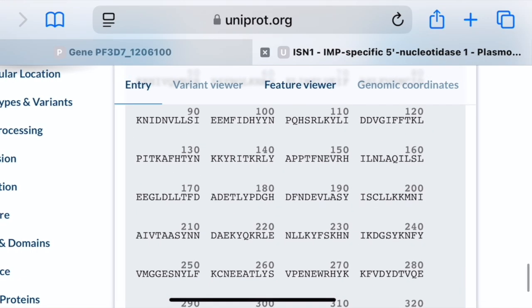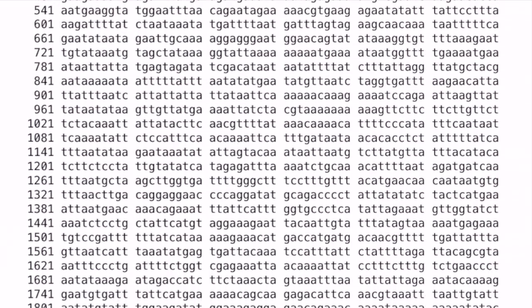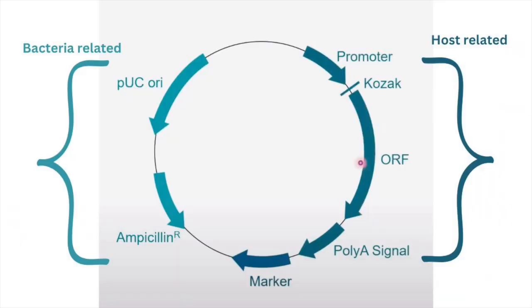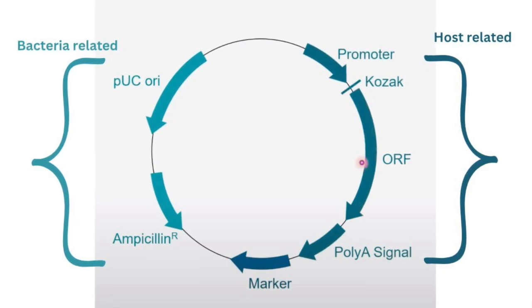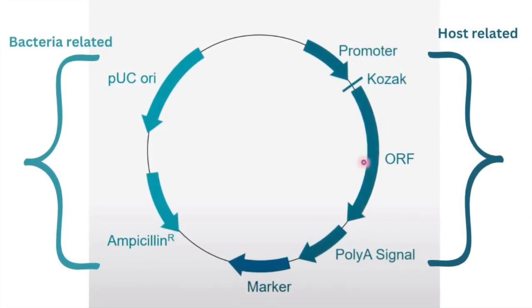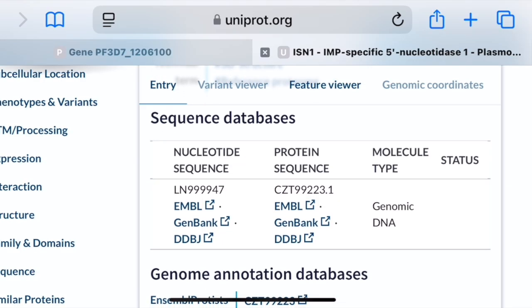And so in this one, we're going to look at where you then get the nucleotide sequences, because if you want to express it, it's the nucleotide sequences, specifically the coding sequences, that you want for placing into a plasmid vector. For expression, initially all the vectors, you're going to start with plasmids, and then if you want to use a viral expression, the viral proteins that are required will then be expressed alongside with the plasmid. And so we're always starting with the plasmid. So let's look at the databases where you can get that.